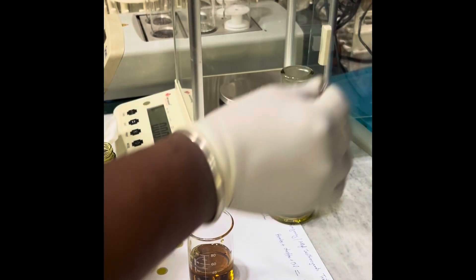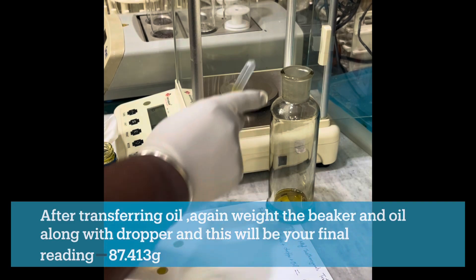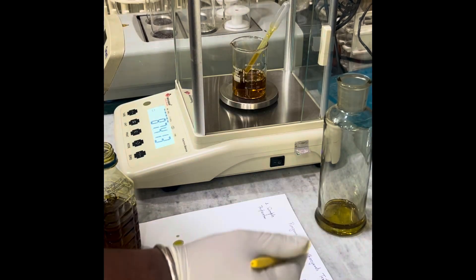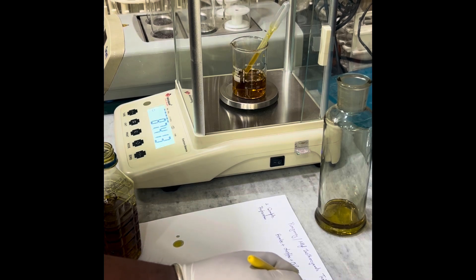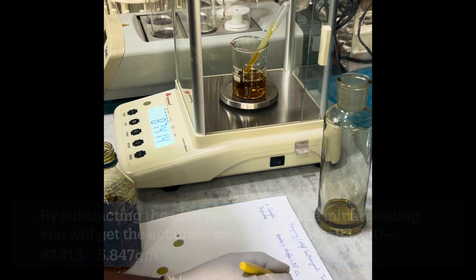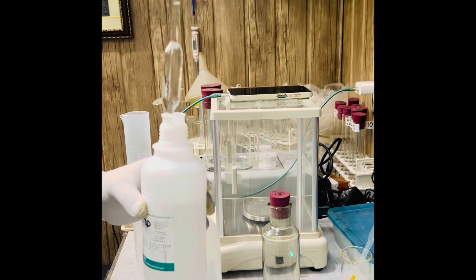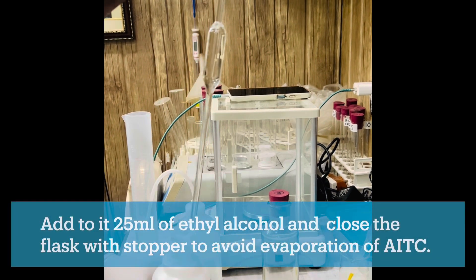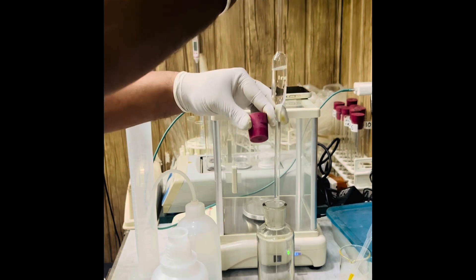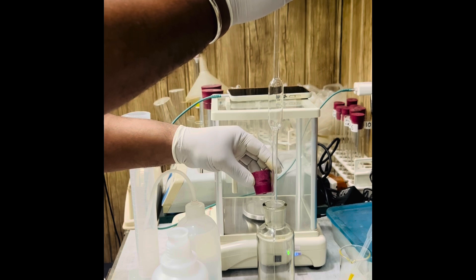After transferring about 5 grams of oil, again take the weight of beaker plus oil plus dropper and note this as the final reading. By subtracting the final reading from the initial reading we will have the accurate weight of oil in the distillation flask. Now add 25 ml of ethyl alcohol and close the flask with a stopper, as the compound allyl isothiocyanate evaporates at room temperature. Also add 150 ml of distilled water and never leave the distillation flask open unnecessarily.